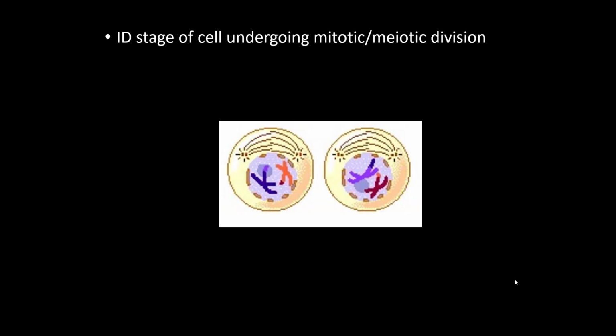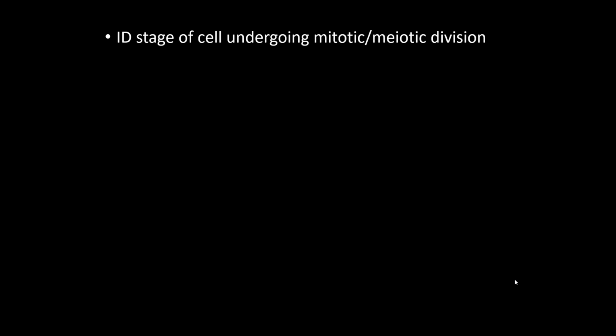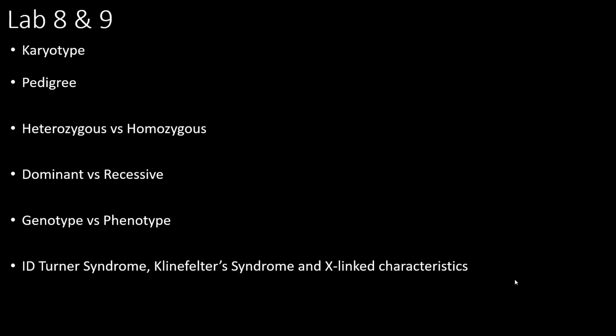Here I have 2 cells. They're about to get ready to divide again. The nucleus is fragmenting, so this is prophase. So since I have 2 cells going through this, this is prophase 2. All right, so this just gives you an idea of going through pictures, but make sure you do review them from your lab book.